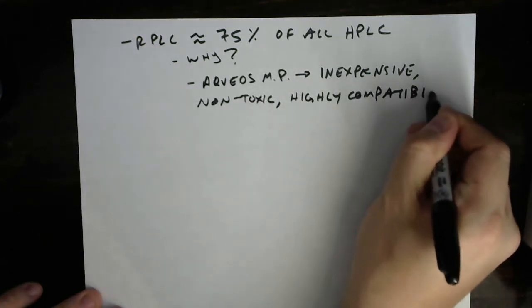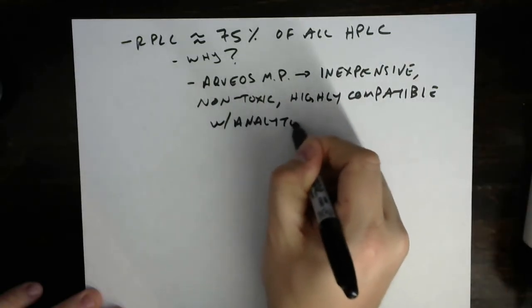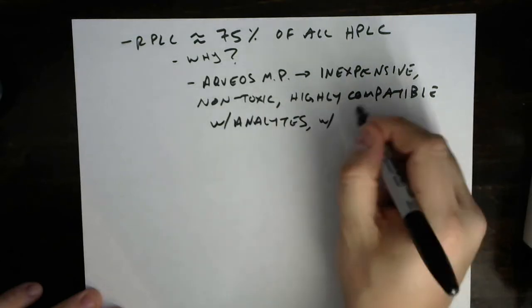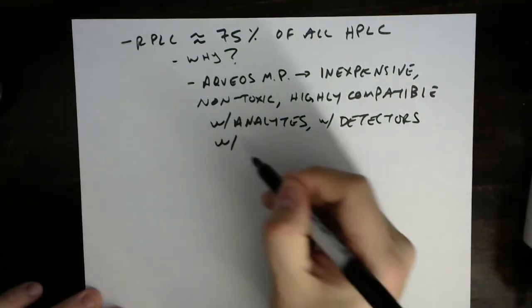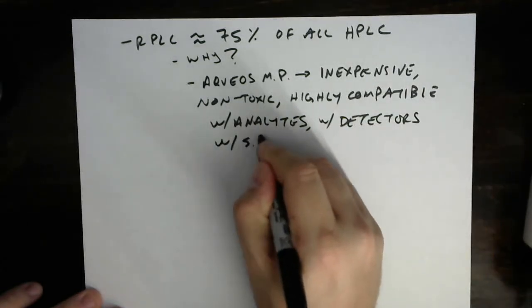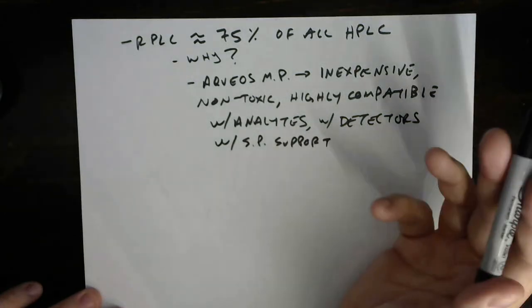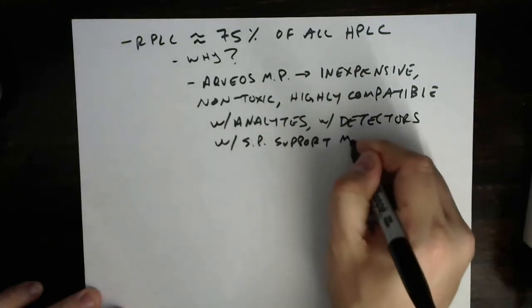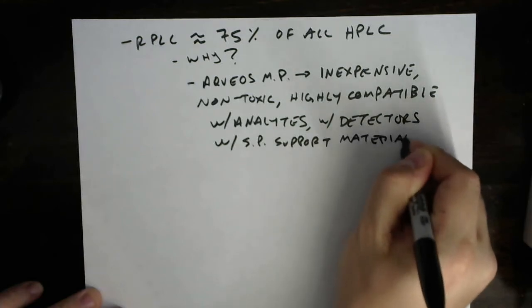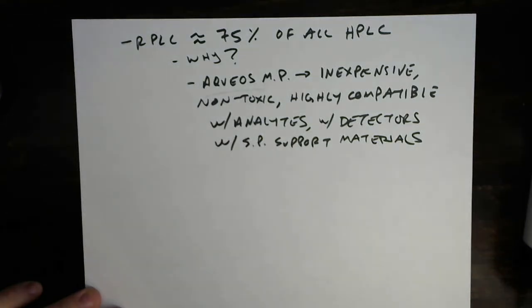And by highly compatible, I mean with most analytes, with most detectors, even with most stationary phase support materials. So we've talked in the past about polymeric support materials swelling with organic solvents, and that's a thing, right? So this is nice too, to not have to worry about that when most of your mobile phase is aqueous. I spelled that okay, I hope.